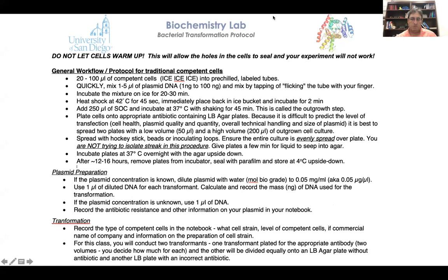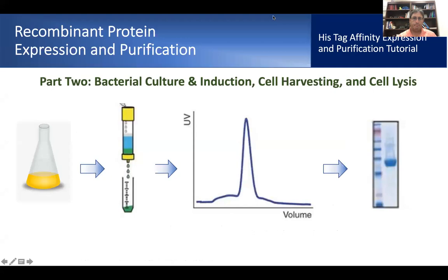All right. So you saw in the video the basic steps for transformation. Both videos that I showed you on the website have this basic protocol in there. So this will be the end of the first of 3 videos to talk about bacteria protein expression and purification.